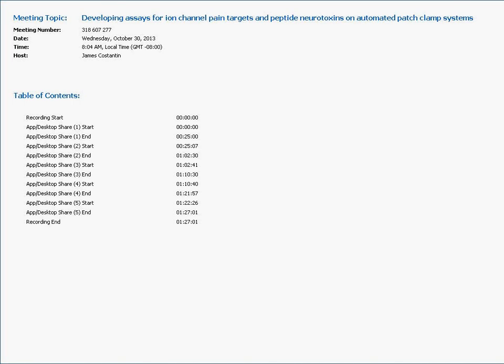The first compound that we tested, just to validate if we could see good current, was the wild type, the 6-BRMT compound. I color-coded this in a rainbow format. In red, you see vehicle. Yellow, you see 1.5 micromolar of 6-BRMT, 3 micromolar, 6.25 micromolar, 12.5 micromolar, 25 micromolar, and then at the end, I did a hammer dose of 4-AP just to kill all the current, in case there's some residual current that I'm unable to see at the end. It turns out that 6-BRMT is a lot more potent than what was seen in Shaker channels. For Kv1.4, we see an apparent IC50 of 0.43 micromolar, which is pretty potent.